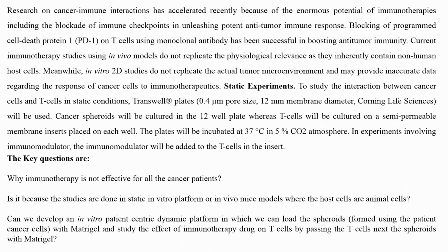So, what to do now? Static experiment. Let us see how static experiments are done. We have just discussed. Let us see here. To study the interaction between cancer cells and T cells in static condition, transwell plates, you see transwell plates, 0.4 micron pore size, 12 millimeter diameter from Corning Life Sciences can be used or will be used, right.